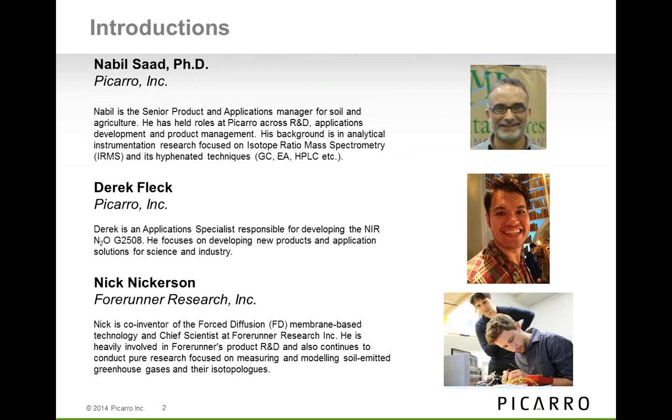Derek is an application specialist at Picarro, and he was involved in the team for the development of the NIR G2508 system that is capable of analyzing concentration species. And this is part of his presentation that will show the comparison between the Picarro G2508 and the gold standard of gas concentration measurement for soil application, which is the gas chromatograph.